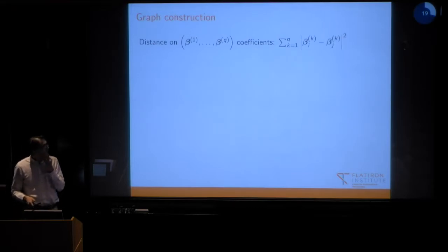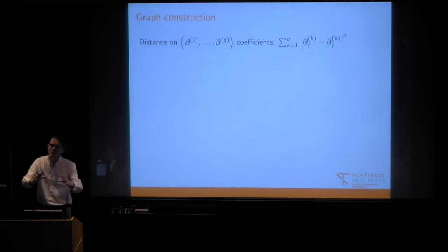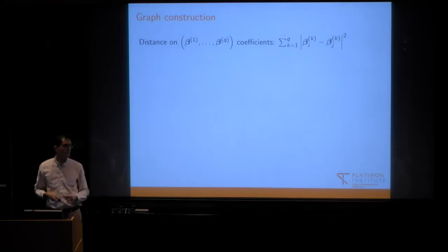All right. So what can we do with this? Like I said, this is very low resolution. There's maybe not a lot of interpretability, but one thing that we can do is now that we have associated the low resolution reconstruction with each image, we can talk about distances. We can say this image is closely related to that image and closely related to that image based on their low resolution reconstructions. Now these images don't have to be in the same viewing direction because we've created a reconstruction for each one of them.